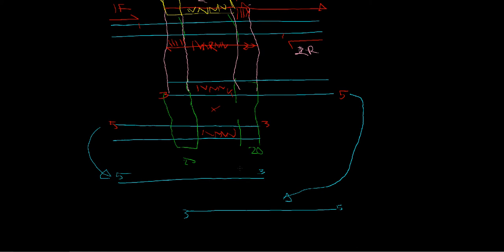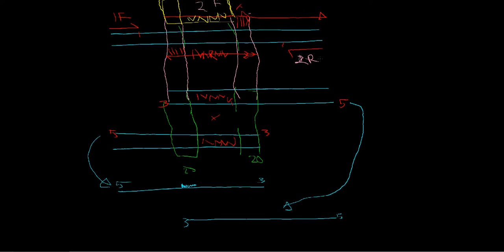So now we start to see why we had that other region of homology. So on this chunk, on this piece of DNA, our oligo bound to this region in order to generate this chunk. And in our other fragment of DNA, let me move up a little bit. In this fragment, this oligo was binding at this region in order to generate these fragments.